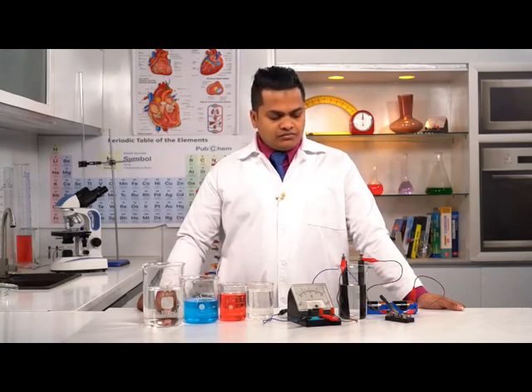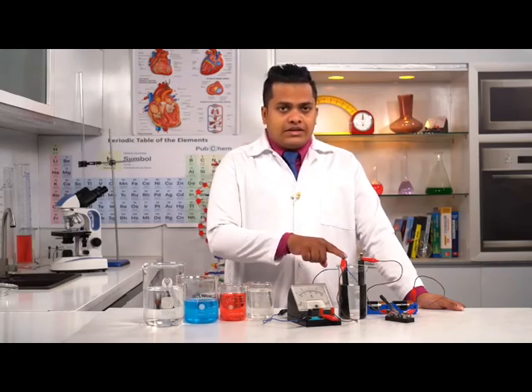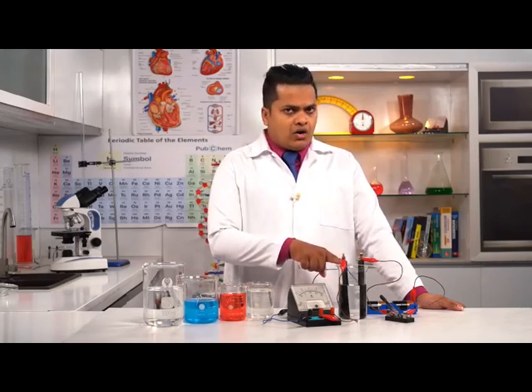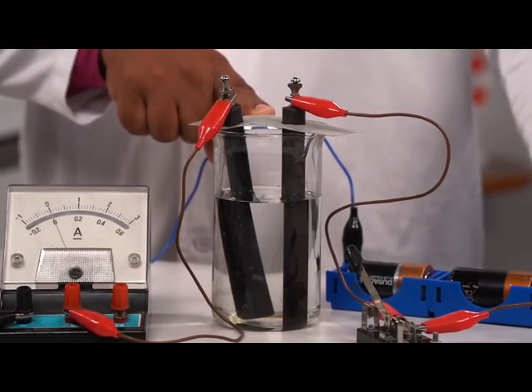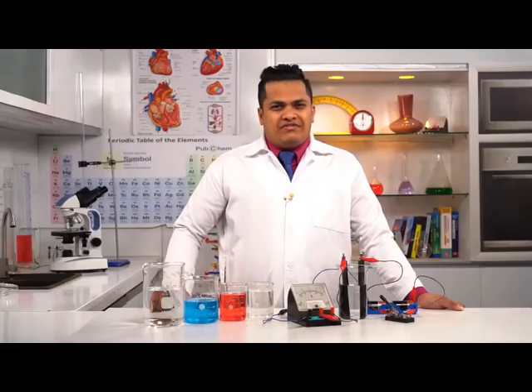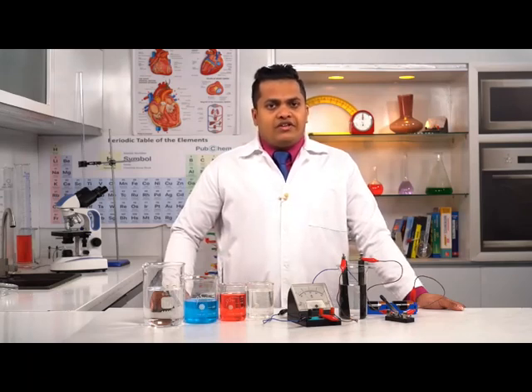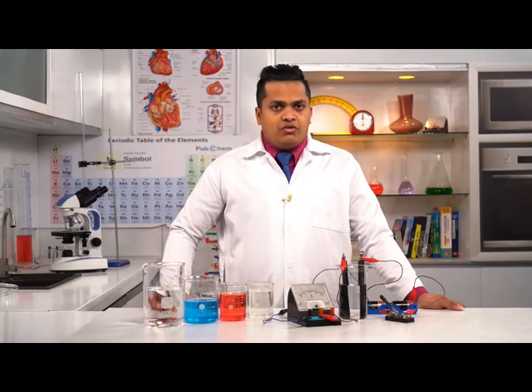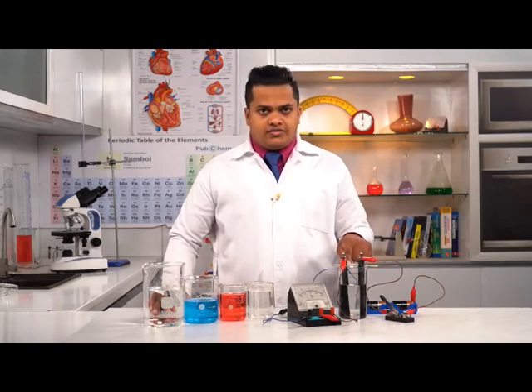So, in here within this beaker, this is water, but however, I have added some acid drops into it. So this is called acidified water. Only a few drops of acid. It can be any type of acid: sulfuric acid, hydrochloric acid, nitric or whatever. Only a few drops, not a heavy amount. So this is acidified water.